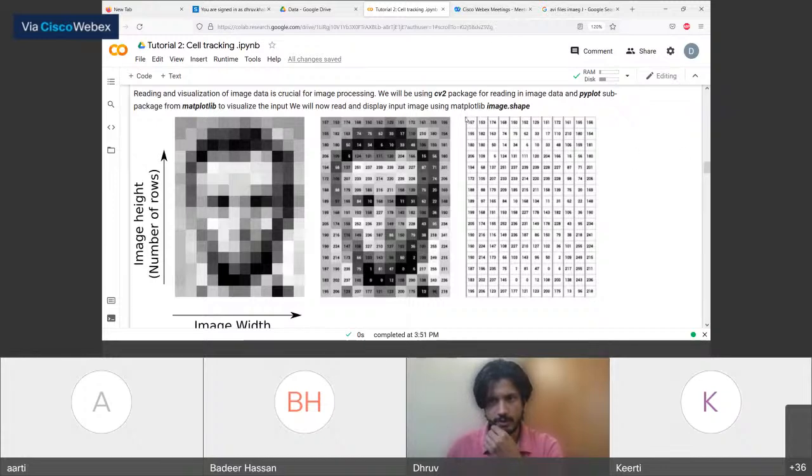What it sees is just an arrangement of rows and columns where each pixel has its own gray value. You can see that there's a difference between the interpretation of what you see visually and what the computer sees in its memory. And our task, as a practitioner of image processing or computer vision, is to identify features from this matrix of data.